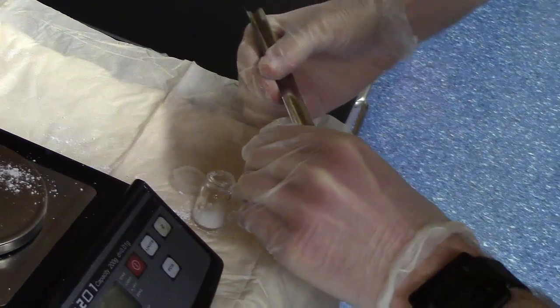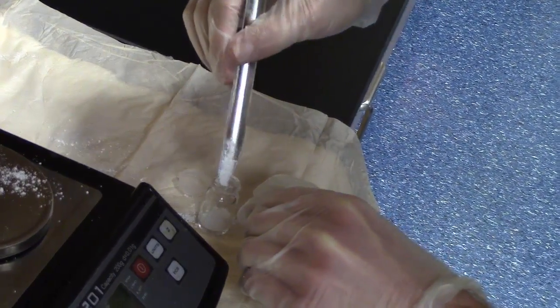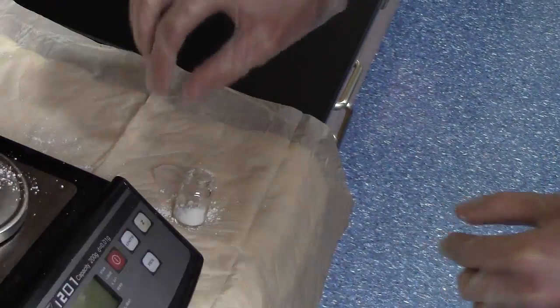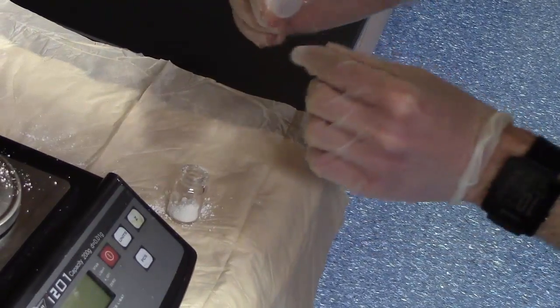Transfer all the powder from the weighing bolt into the glass vial, taking care not to spill any of the powder on the work surface. Then, seal the glass vial with a vial cap.